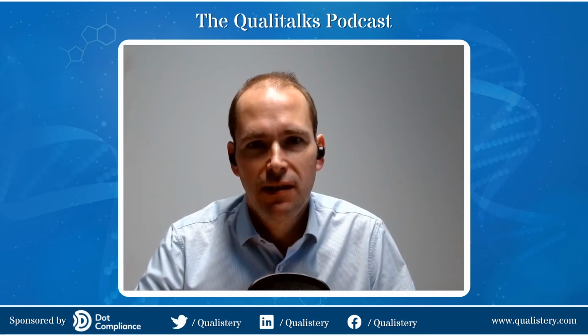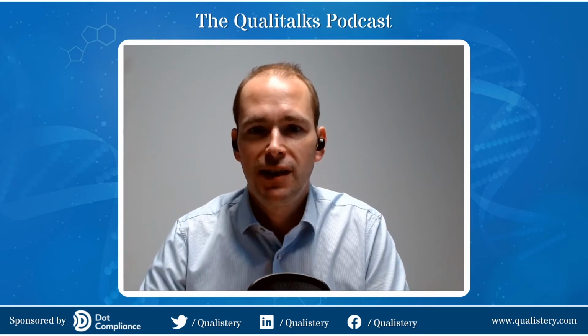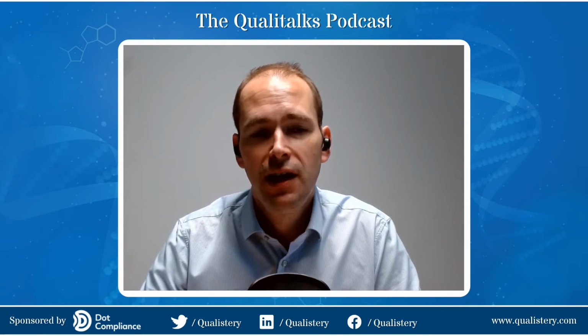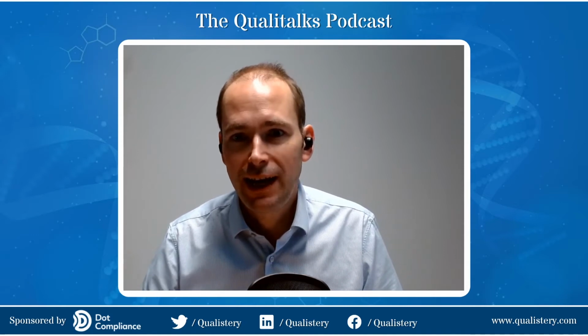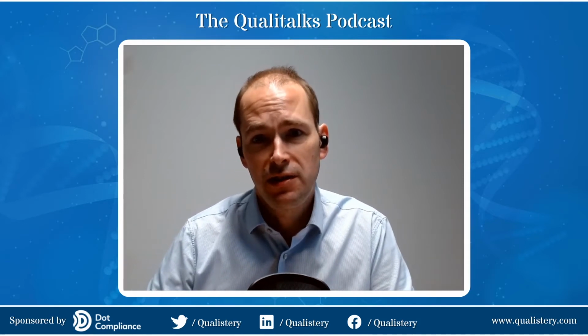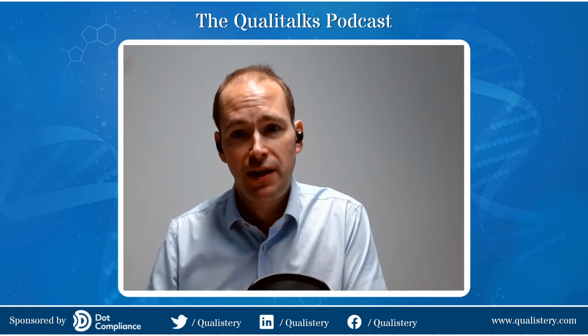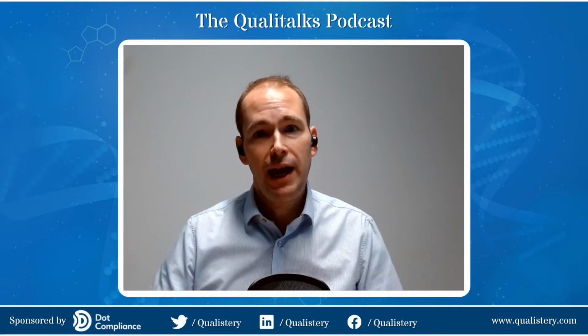What should it contain? Well, I think it's about understanding, for example, you mentioned fluids. So product formats. If you've got a very large fluid format, let's say it's a litre of product that's being sterilised, the question then would be, how can we make sure that that cycle doesn't last for 8 or 9 hours? If we can reduce that cycle time, but still maintain that sterilisation efficiency, so we can have the same level of kill but a shorter time frame on the cycle, then it's perhaps not a quality issue, but we can increase productivity of that machine. So once you've purchased that autoclave, it's very difficult to retrofit some of the cooling cycles, for example, that might help cool that load.